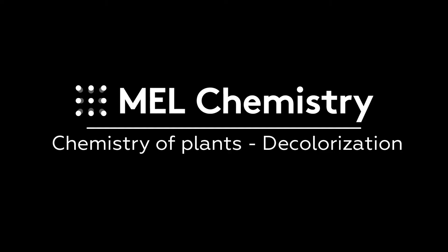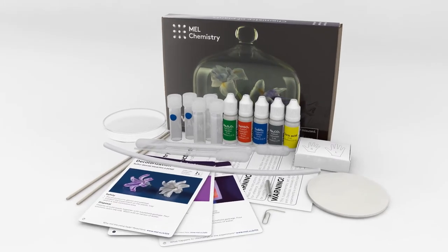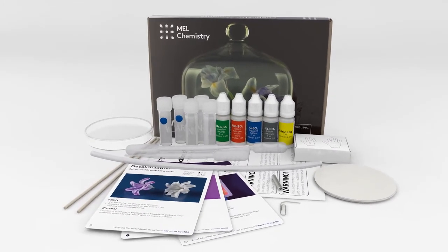Welcome to the wonderful world of chemistry. Today, with the help of the Chemistry of Plants set by MEL Chemistry, we will see how sulfur dioxide bleaches petals.